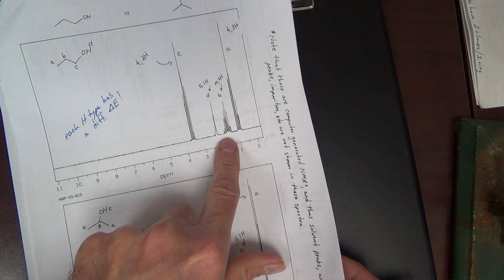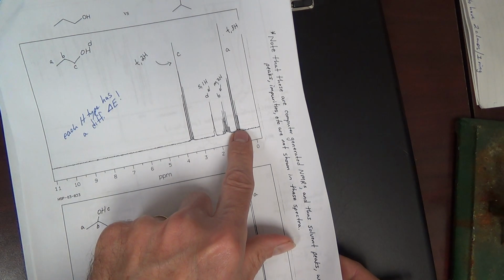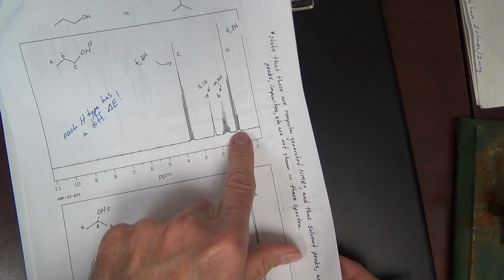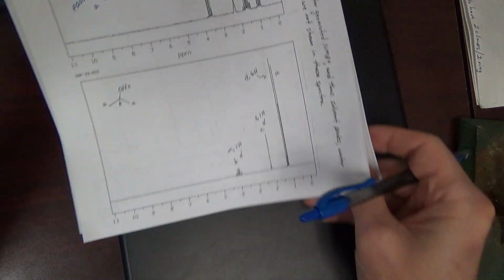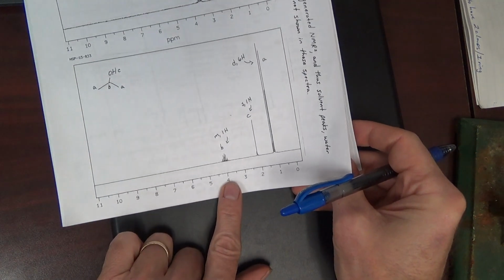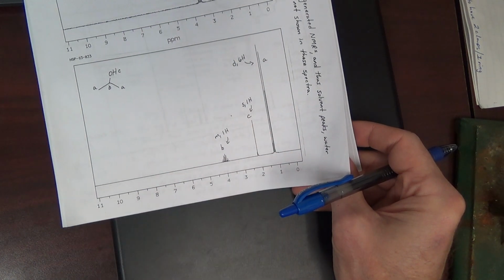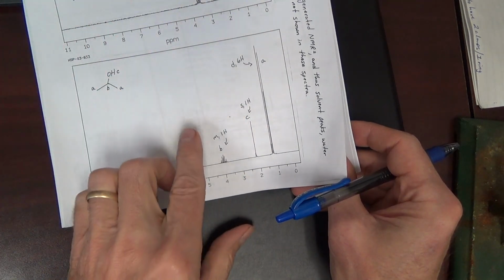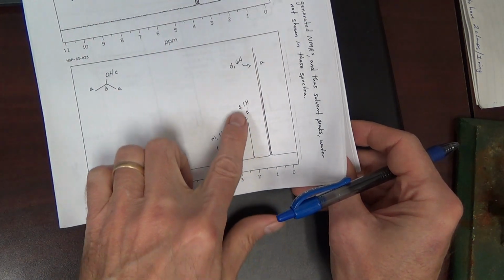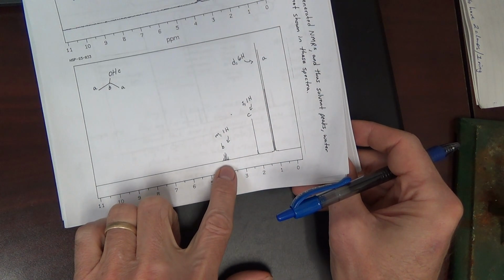Here we have multiple lines. If it's more than 4, we're going to call it a multiplet. And then to the far right, most upfield in the spectrum, we have this triplet. And that's my T, triplet for 3H. Down below we have a multiplet, a singlet, and then a doublet. So the question at this point becomes, why are some signals split, and what makes it a doublet? What makes it a multiplet? That's what we need to look at now.